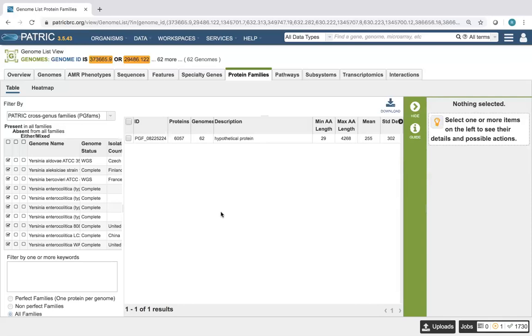This is an important first step that you should use before you build a tree, because these trees can take a long time to build, and you don't want to waste your time waiting for something that's bound for failure. And that's all we have for today.